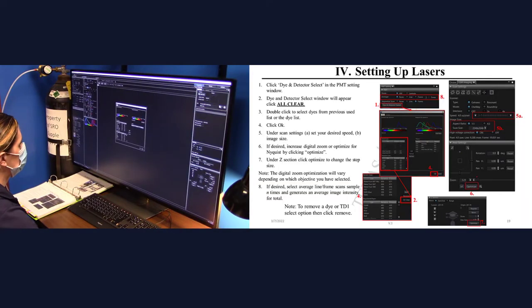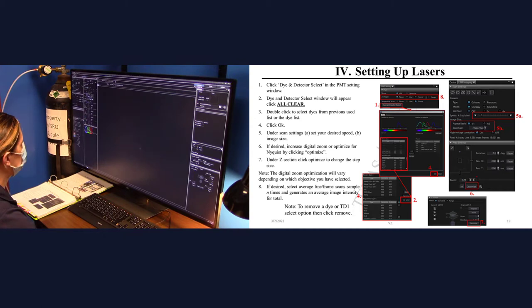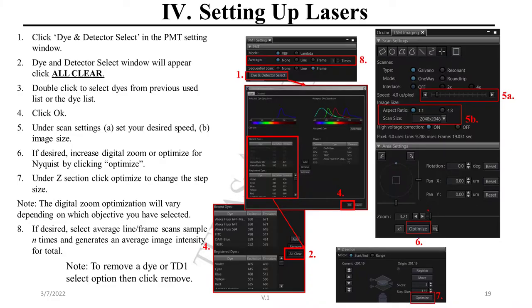Click the dye and detector select in the PMT setting window. Click All Clear, select the dyes you need for your imaging session, and click OK. Set your desired speed and image size. Optimize for Nyquist if desired. Optimize for the Z height. You may select average line or frame scans if desired.